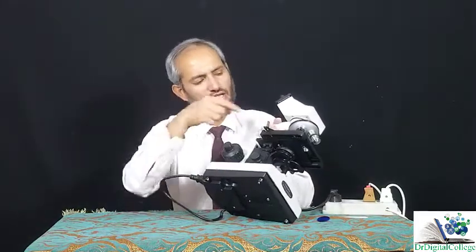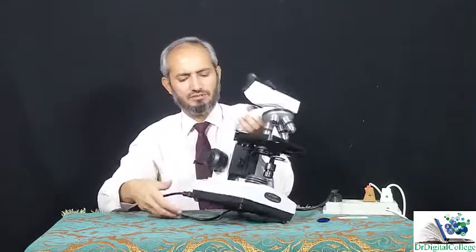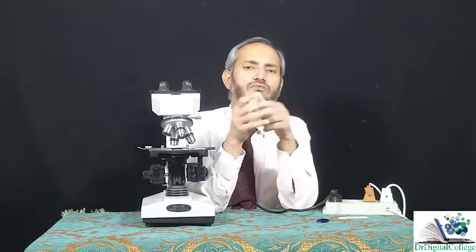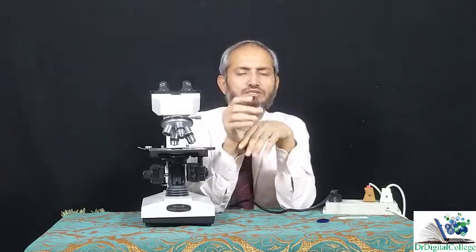This is just like the pupil of your eye, which can be increased or decreased by the muscles of the iris. So here, this aperture can be broadened or it can be shortened. Usually at low magnification, we need to use a broader aperture, and at high magnification, we need to decrease the aperture. At a smaller aperture for high magnification, we can achieve good resolution because lens aberration is controlled by decreasing the aperture of lenses. You might have studied it in your physics classes.